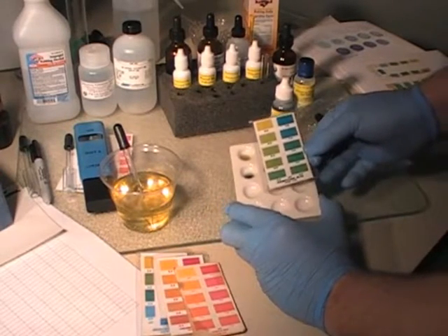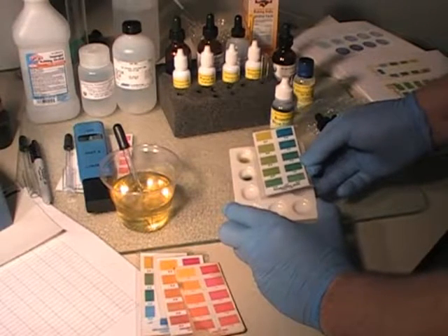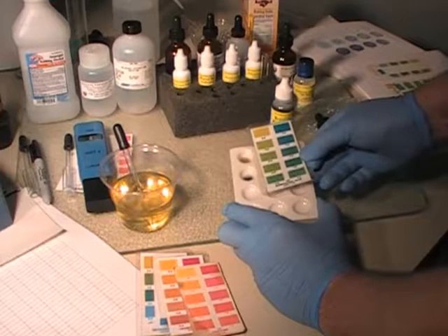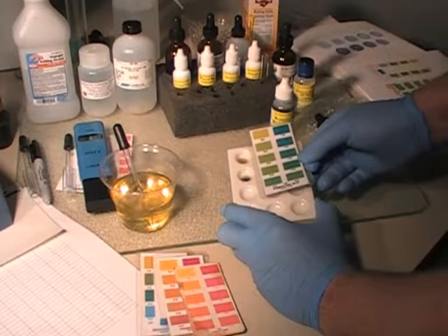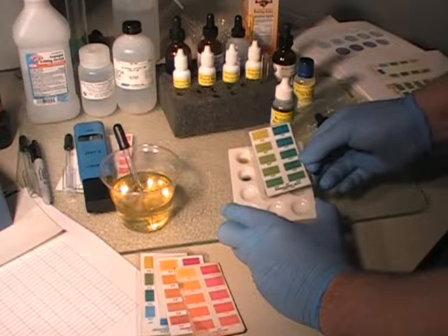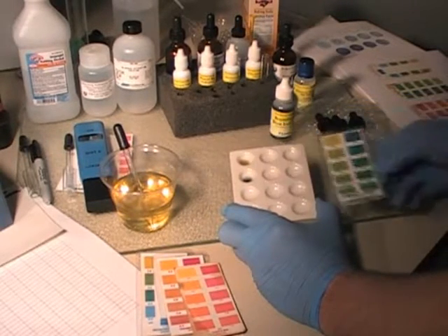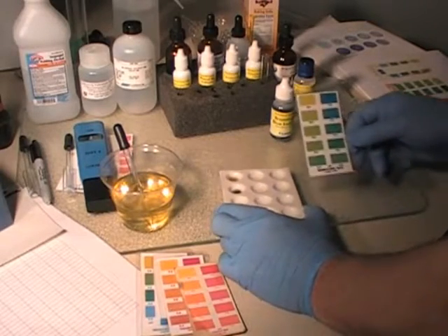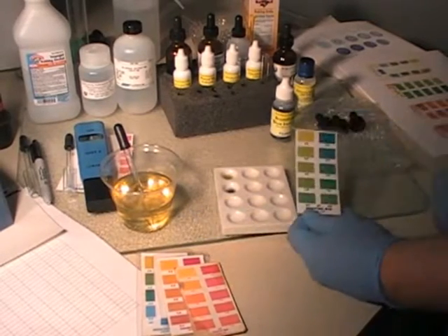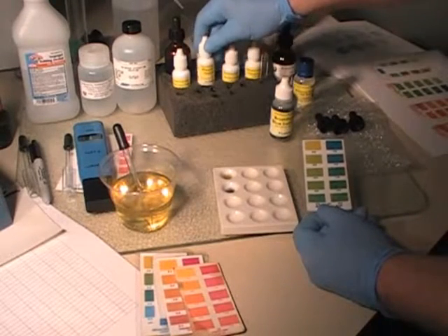So what are we looking at here? That top number is looking at about a 6, I'd say a 6.3. Very close. It's almost a 6.4, but it looks just slightly lighter than a 6.4. So it's a 6.3. And what that means is that with that number, we're not going to have to go to the chlorophenol red to verify.